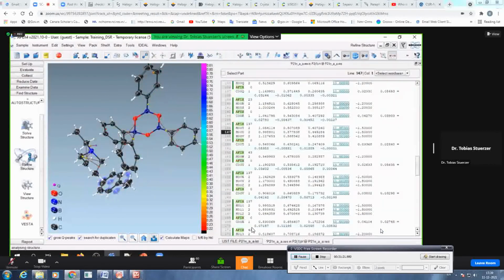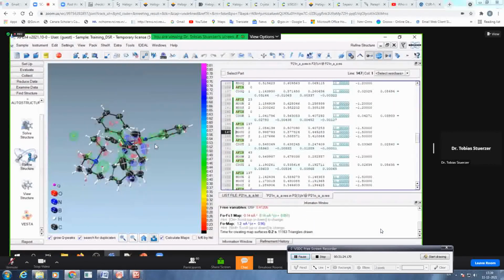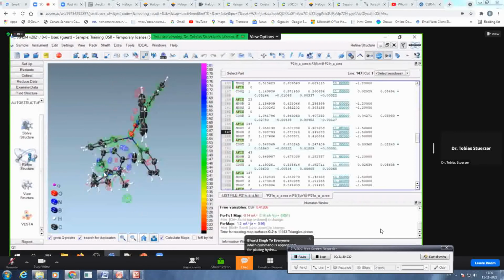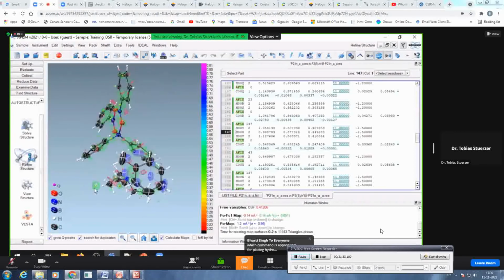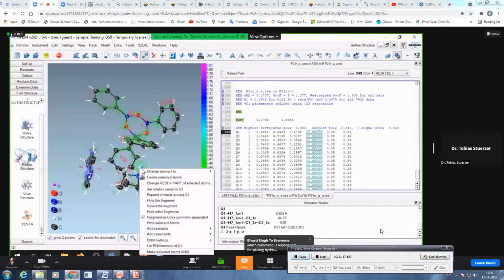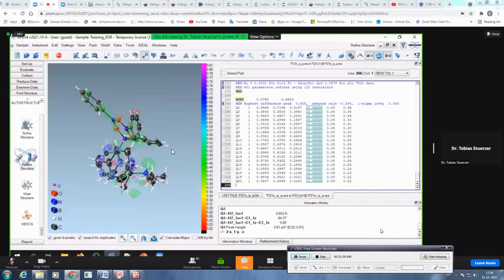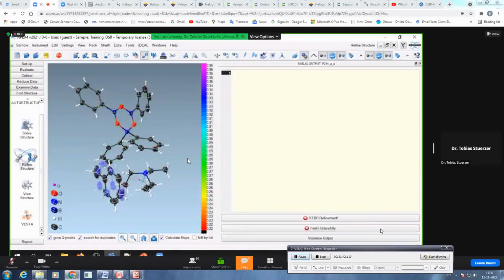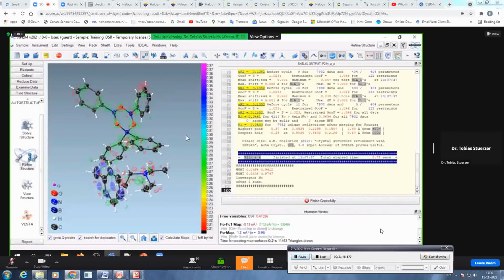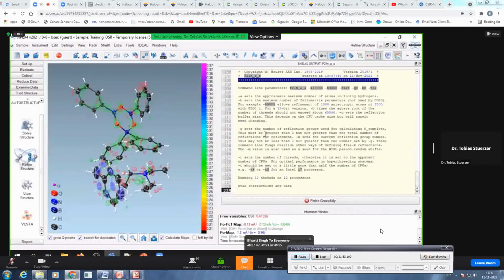There's one thing remaining. Check always for charge balance. If you properly check that, you will see that here's nitrogen missing. And not nitrogen, hydrogen. You can add it with a riding model or whatever, or with an HFIX just for finishing it properly. I would just put the hydrogen here, freely refined. I know that's something you shouldn't do, but just to make it clean. Refine it. And then we started at a 17% structure, and now we're down to 4.5%.